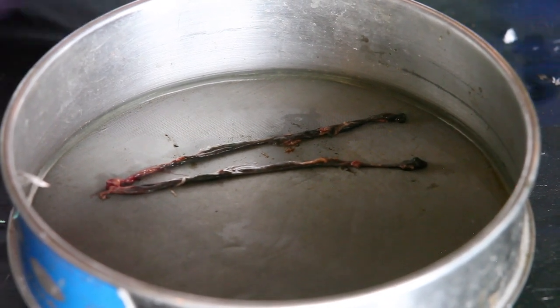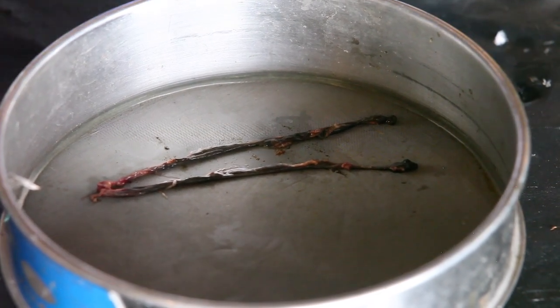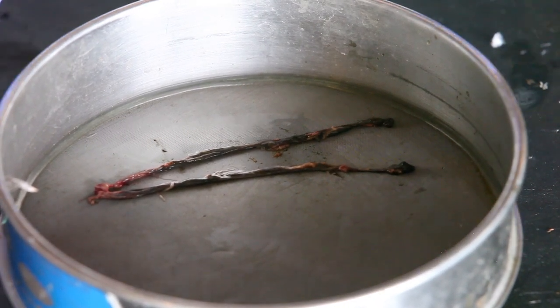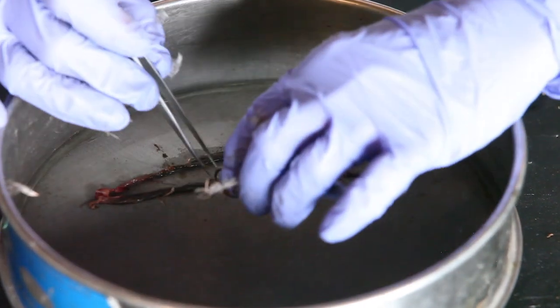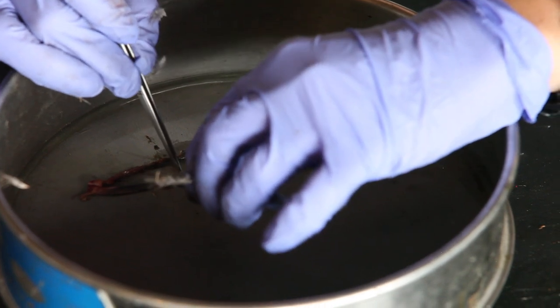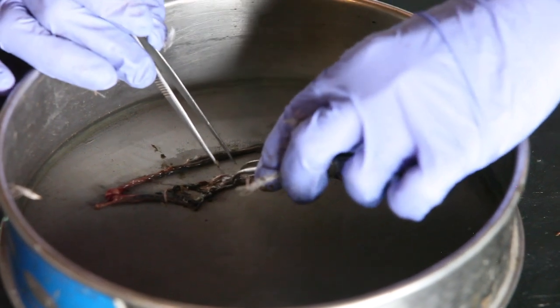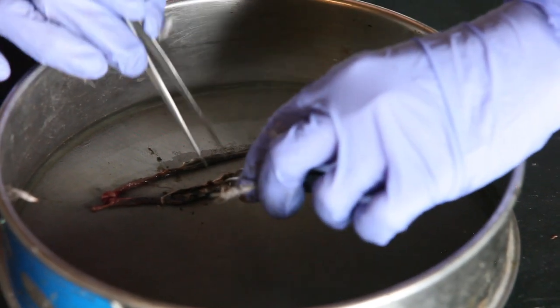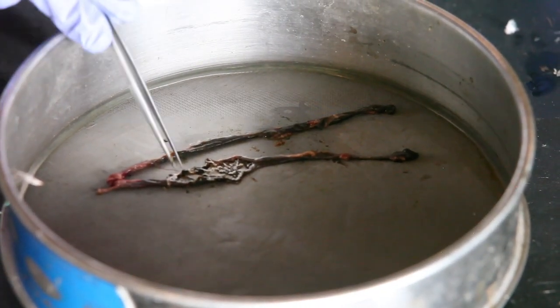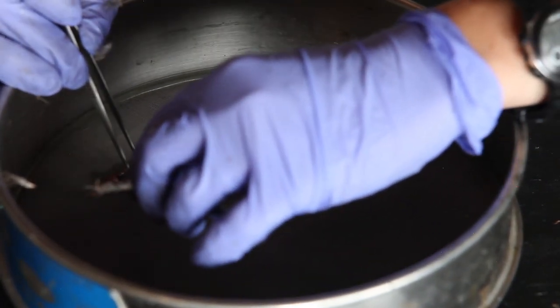Okay, so now is when we want to actually get to the worms. And the ceca, it's like the intestine, so it's two tubes. And so what we want to do is open the tubes up to get to the worms. So at this angle, we're going to go like this, and I'll just take my forceps and pull it apart. So you can see how I'm laying it flat, opening it up flat. Here's the tube still, here it's laying out flat. So I'm going to do that to the whole length, both sides.